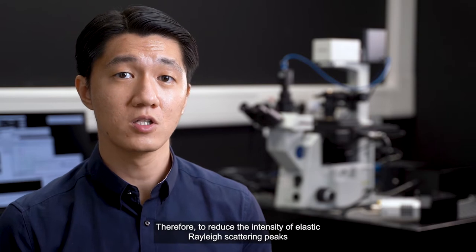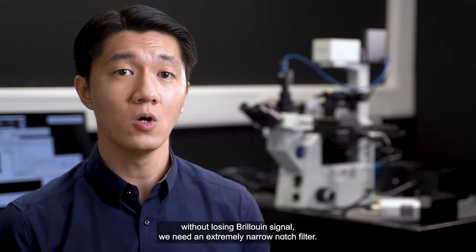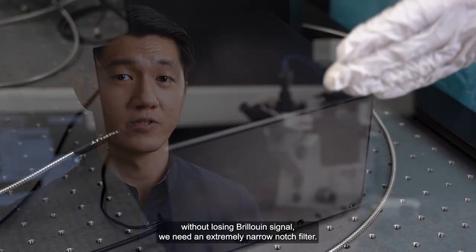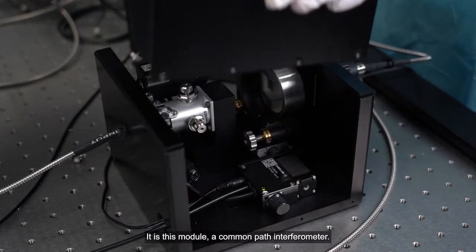Therefore, to reduce the intensity of elastic Rayleigh scattering peaks without losing Brillouin signal, we need an extremely narrow notch filter. It is this module, a common path interferometer.